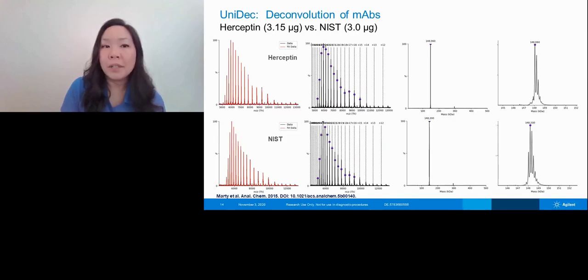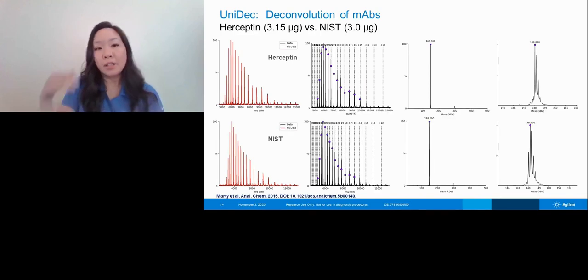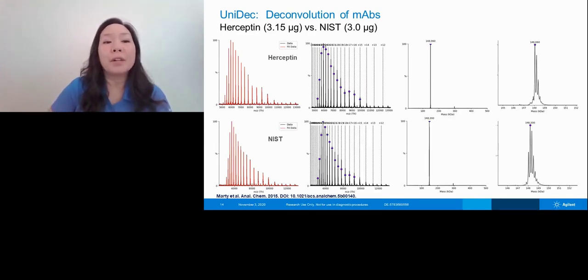So it's actually very informative and a great way of generating data. We've been using a lot of Dr. Marty's UniDec for a lot of our non-covalent complexes, whether it's nano-ESI, CaP, even the standard flow work. And so what you'll be seeing in the next couple slides with the standards are the analysis using UniDec for the native MS work.